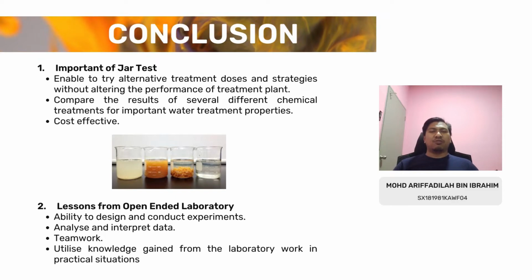So I'm going to conclude about the jar test that had been presented by my friends just now, and also conclude on what we have learned from this open-ended laboratory.